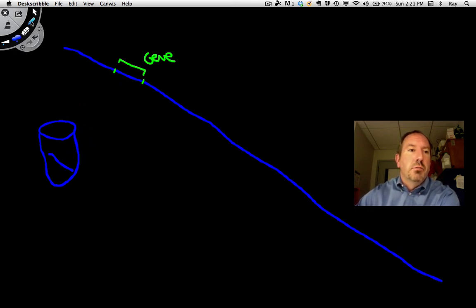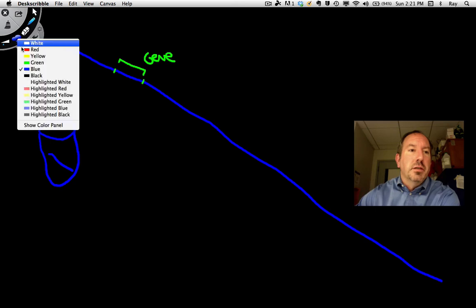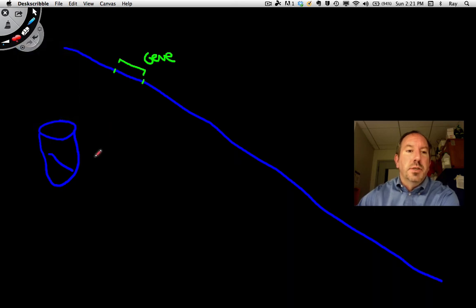Well, we're going to need to add a few things, clearly. So let's make a little list of things we're going to need to add. Number one is the DNA from the redwood tree, so that's the DNA or the template. Then we're going to add an enzyme called DNA polymerase, because that is what's going to replicate the DNA.